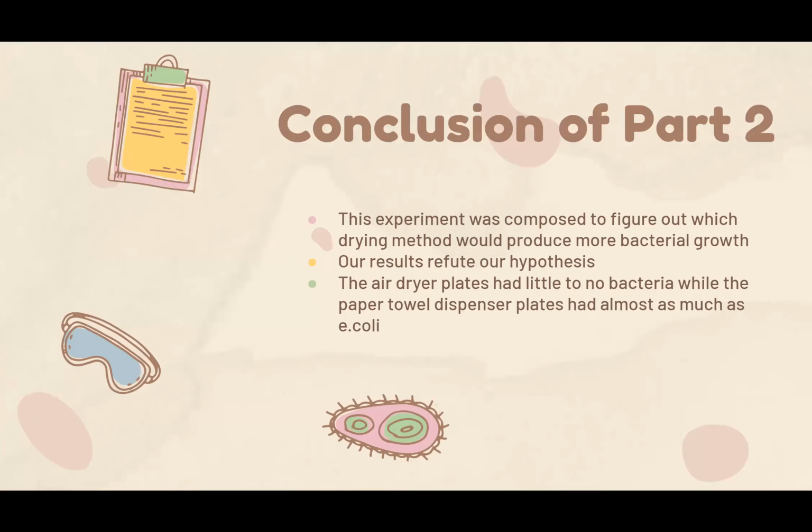So we can conclude that our results refute our hypothesis that the air dryer would produce more bacterial growth because, like Asia said, there was more bacterial colonies on the paper towel dispenser plates.